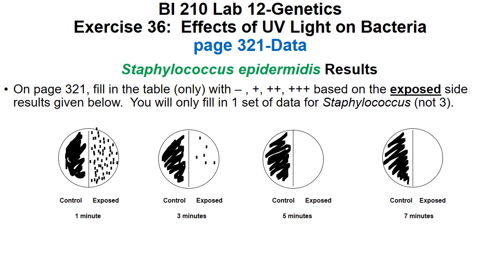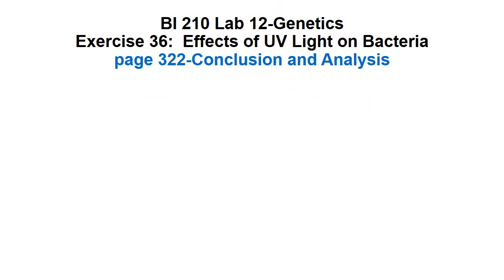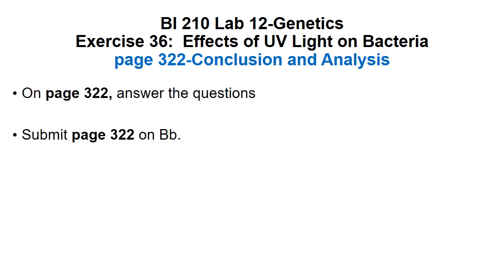So was there a difference in the amount of growth for Staphylococcus versus Bacillus, and why would that be? Page 322, conclusions and analysis. On page 322, answer the questions. You will be submitting page 322 on Blackboard.